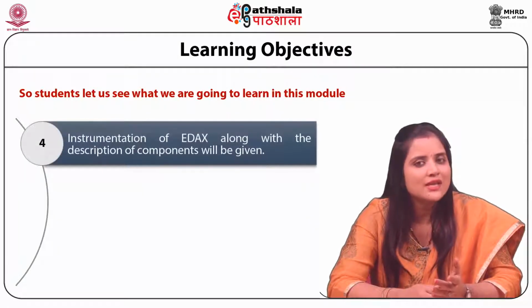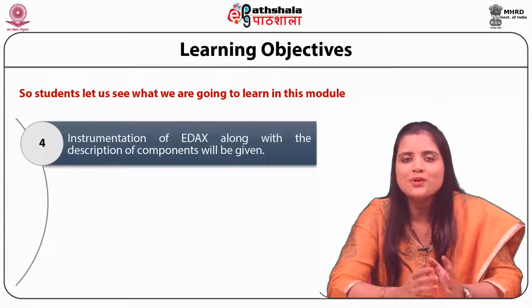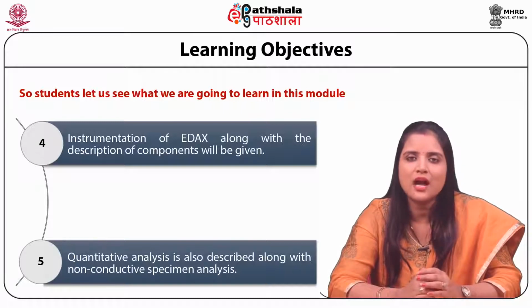Instrumentation of EDAX along with the description of components will be given. Quantitative analysis is also described along with non-conductive specimen analysis.